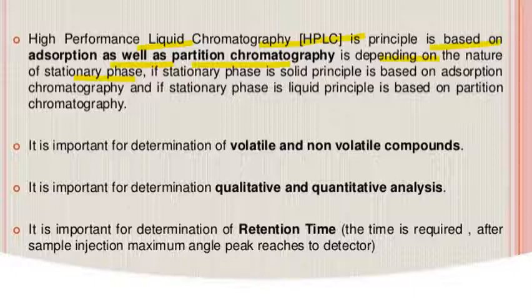And if the stationary phase is liquid, it is based on the partition phenomena, that is the solubility difference of the components among the liquid phase. So here also these two principles are involved. If the stationary phase is solid, the principle is based on adsorption chromatography, and if the stationary phase is liquid, it is based on partition chromatography.